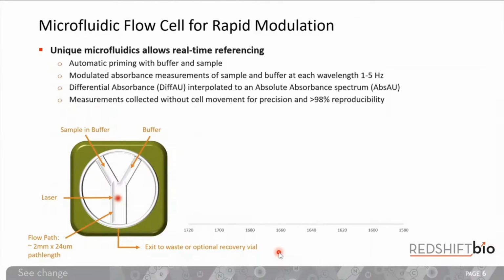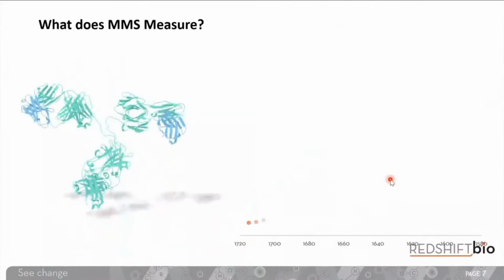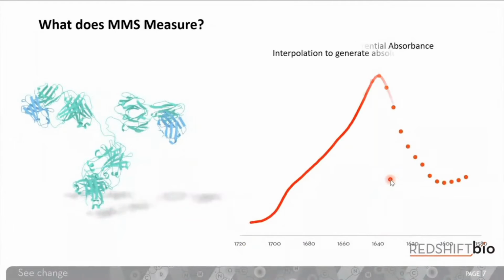So what happens? There's a little graphic that goes on here. When you hit the start button, the sample and the buffer are propagated through the fluidics. They fill up your flow channel, buffer, sample. When you hit start, the instrument automatically modulates back and forth between sample and buffer at about 1 hertz. It is working through the amide 1 region at 4 wave number spacing as it measures sample, buffer, automatically subtracting the buffer from the sample, giving you the differential absorbance of only your protein of interest at each of those wave numbers.